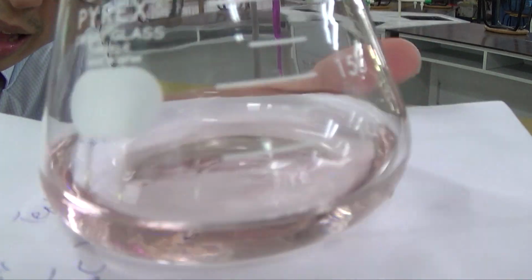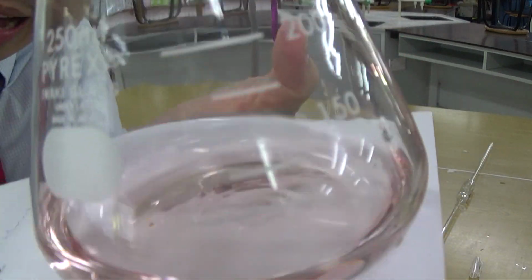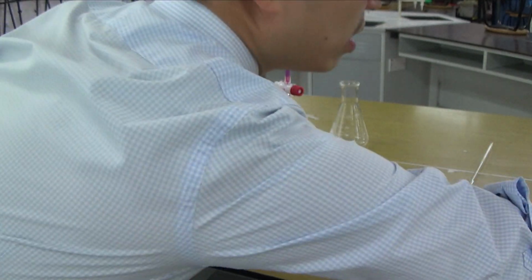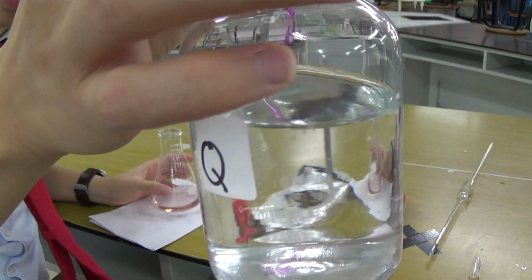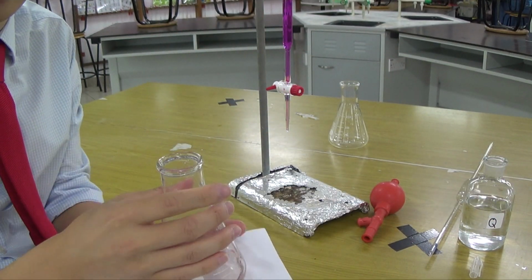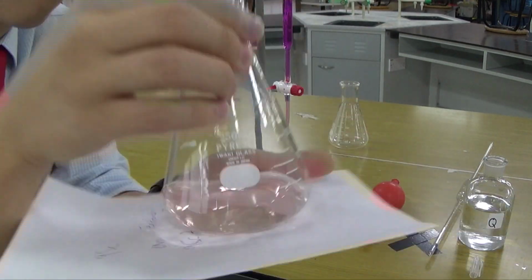As you can see, the color now, it is colored. Hopefully you can see it is colored, in comparison with this original solution, which was not colored. So we can be sure that this has just turned, but this can never be your exact titre. This is your rough titre.